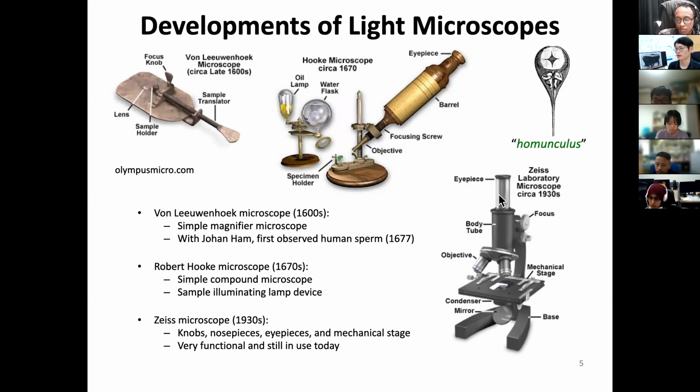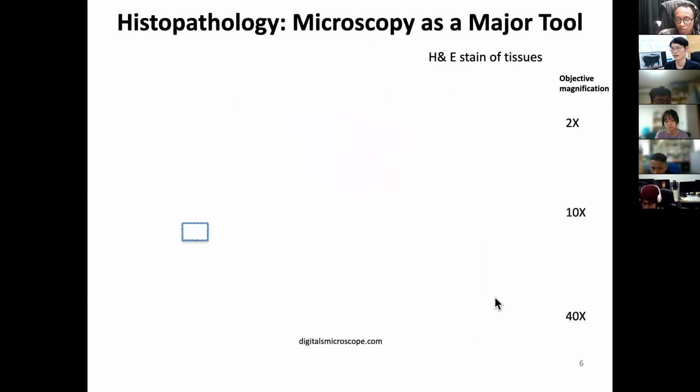So it's functional: you can see the eyepiece. As I said, there's an objective lens, there's a body tube, okay? Remember you have a 4F system tube lens, and there's a stage, and there's a condenser lens, which illuminates the sample in a small area, and there's a mirror. Now we replace this part with an LED, right? Because it's much cheaper and easier.